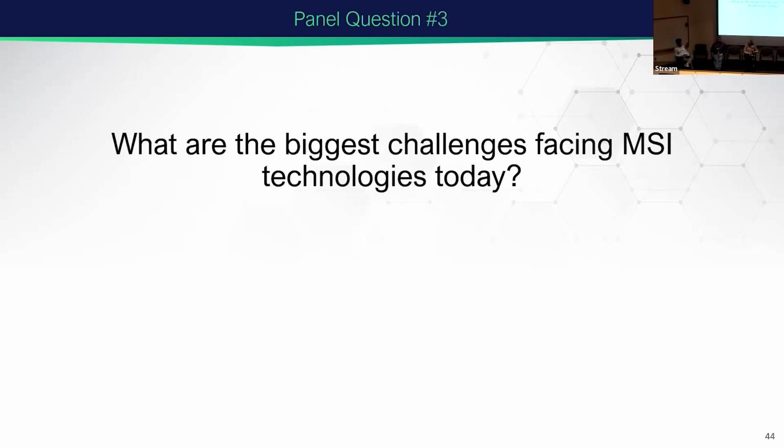Well, I guess I'll take Dušan's answer and cube it. Quantification is possible in some ways with SIMS, but it's a lot of work and money. Yeah, expensive experiments basically. And then again, the sample preparation. If you want to lock things in, we use resin. It's 99% carbon-12, so you've lost your carbon-13 signature.